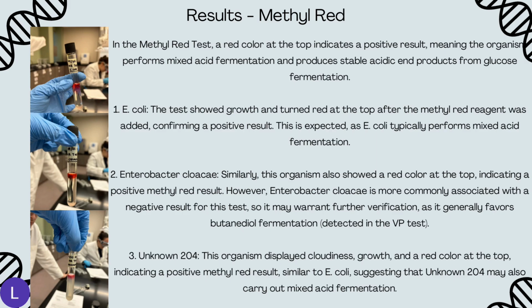By knowing that, when we analyze E. coli, we see that it has some growth, and it also showed a red color at the top after the methyl red reagent was added, confirming a positive result, which is expected because E. coli usually performs mixed acid fermentation.